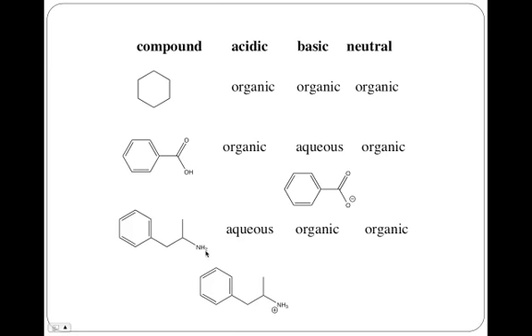It's an amine, it's an alkaloid. Neutral, it's going to be dissolved in the organic solvent. If the aqueous layer is basic, it's still going to be a neutral compound in the organic layer. But in acidic media, you're going to protonate that nitrogen and form the ammonium ion. As soon as you do that, it's aqueous soluble, and now in aqueous acid, it'll partition into the aqueous layer.